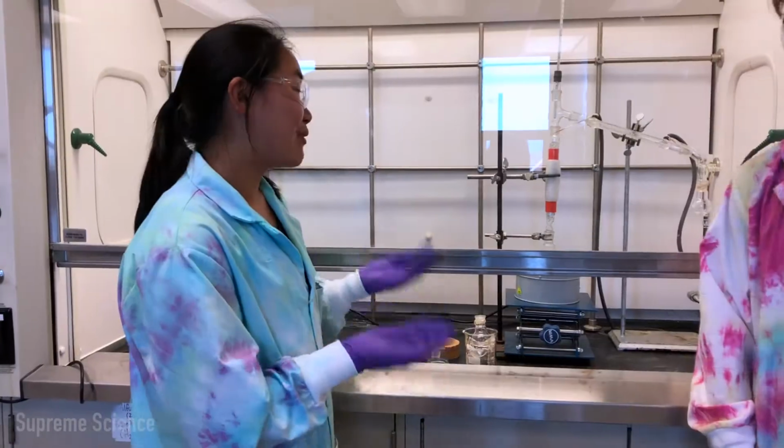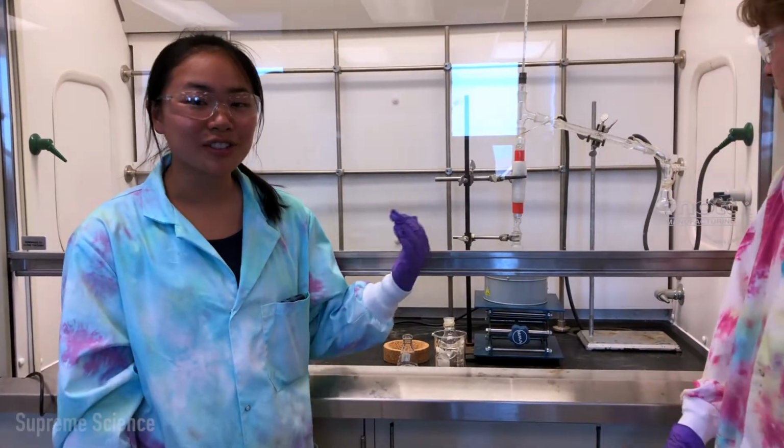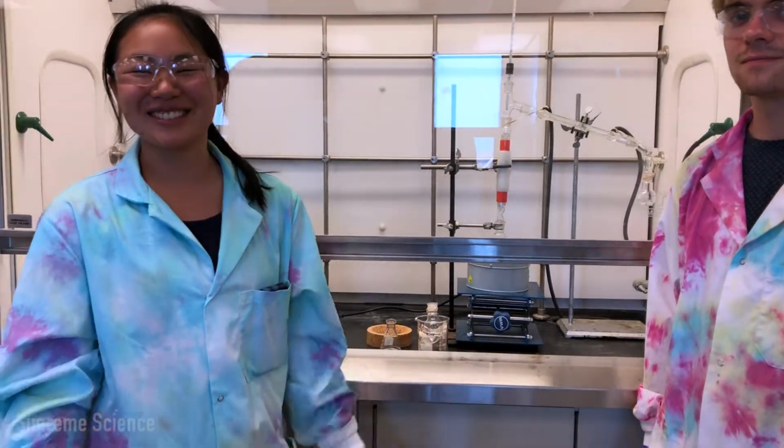Now we're done, so we can disassemble our fractional distillation setup in the reverse order, and that's fractional distillation.